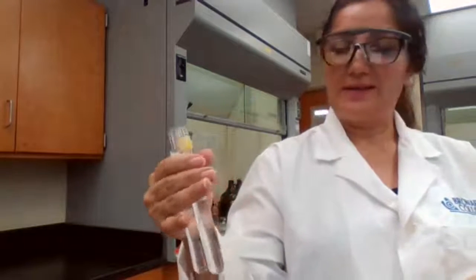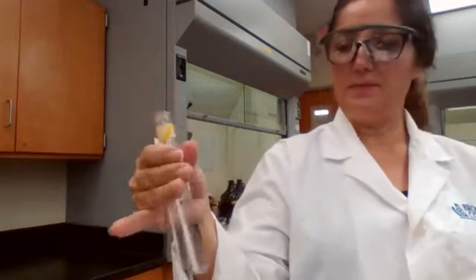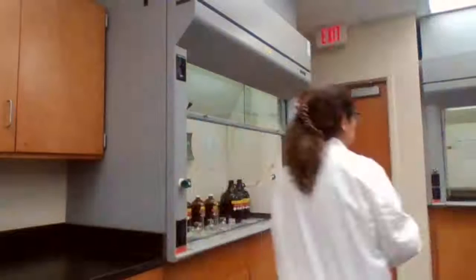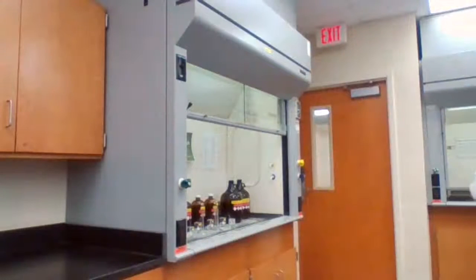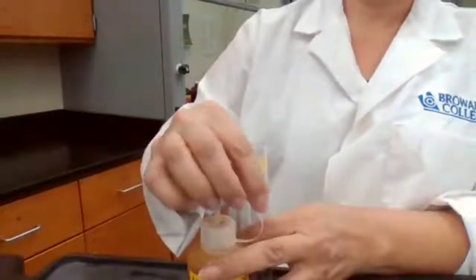We are going to add the methyl orange indicator to the 2 test tubes. This is your indicator. The indicator is called methyl orange.